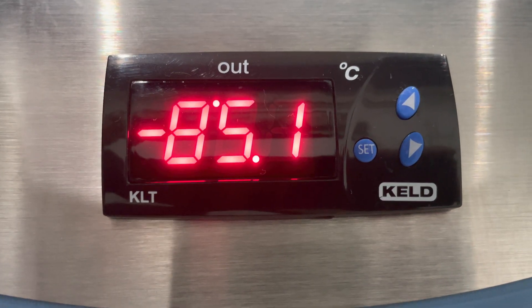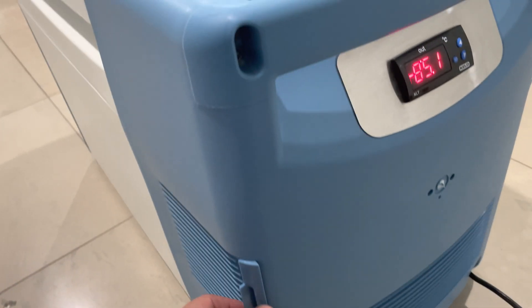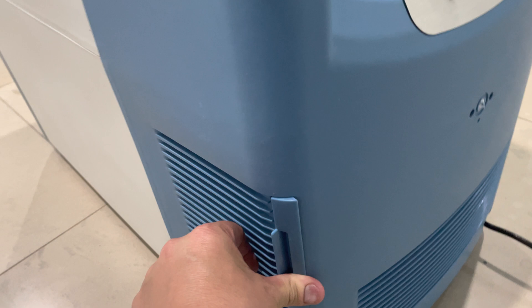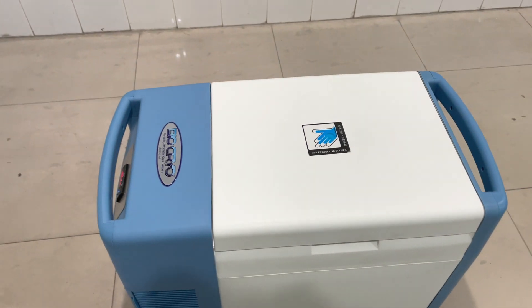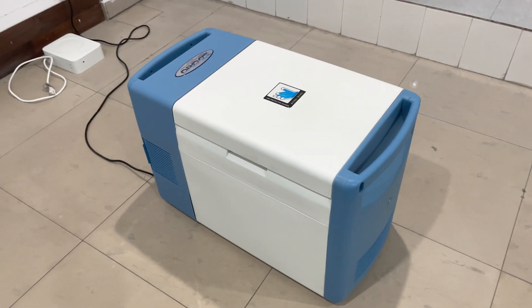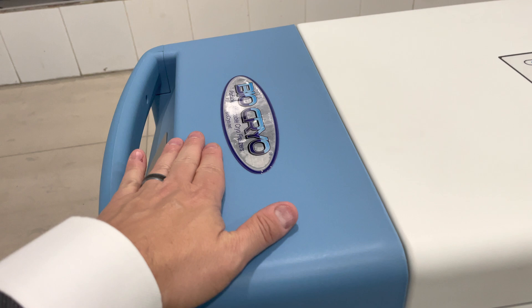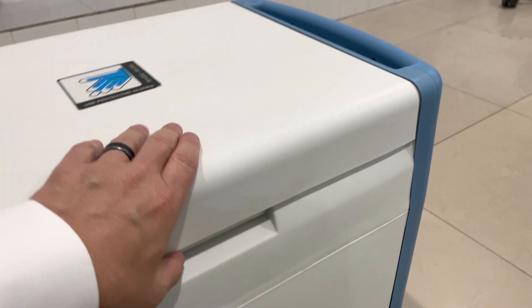You can use the settings here on the panel to control whether you want negative 40 or negative 86. It's got a very small footprint. On both sides it has these filters that you should clean every few months. The net weight is only 21 kilograms, so it's very lightweight, and as you can see it puts off minimal amounts of heat — just a little bit warm to the touch.